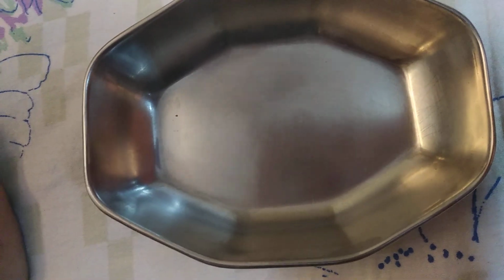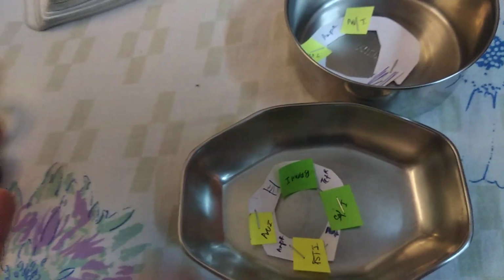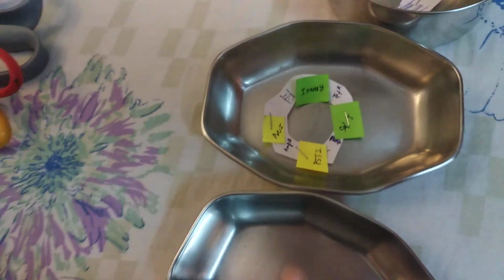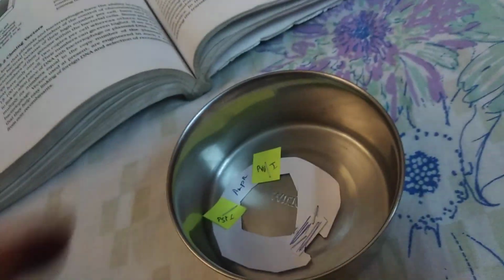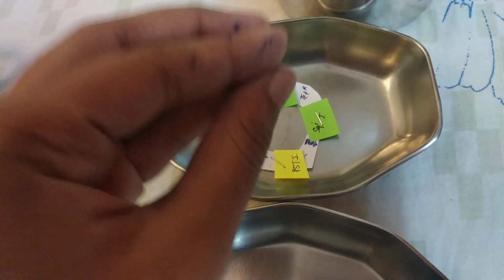And the third one sadly did not get any plasmid, it did not even get transformed, it's a non-transformant, it doesn't have any plasmid, my plasmid could not enter it. So these, as you can see, are my three different hosts. Now I'm going to do a plating, right? And then I'm going to find out which one is which. So as a biologist, you don't really know which one is non-transformant, which one is transformant, and which one's non-recombinant and which one's recombinant. You don't know. You have to find out using an experiment.